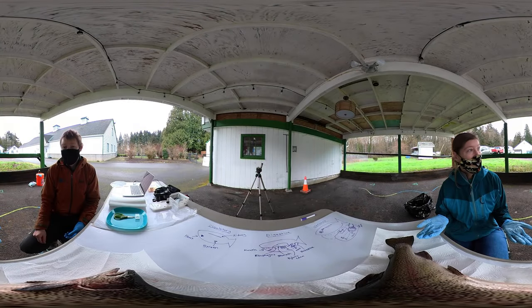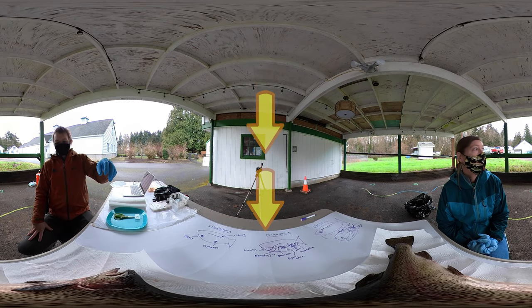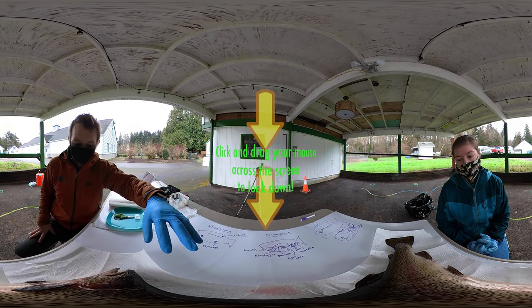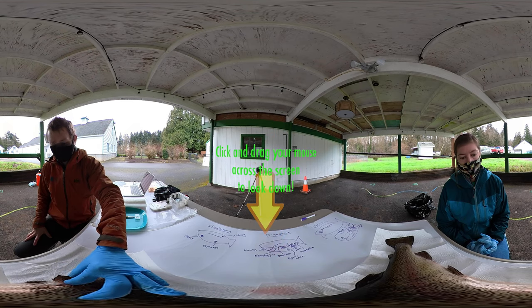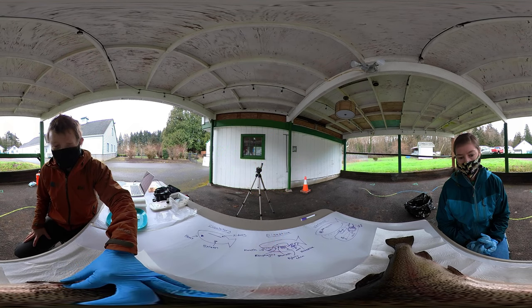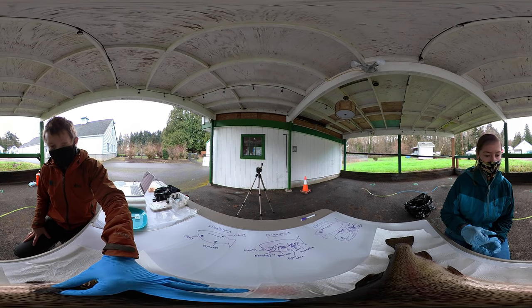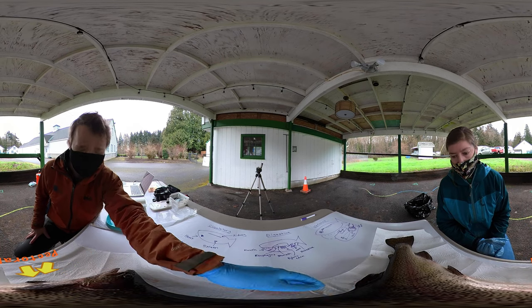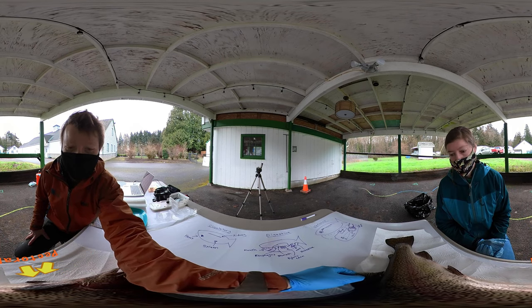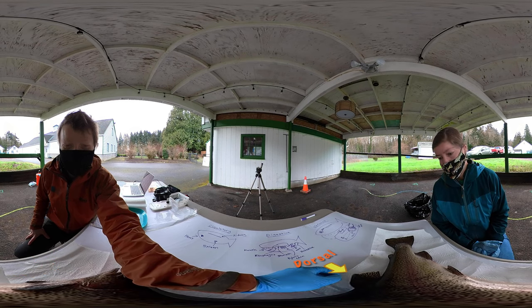Maybe we could start with some external or outside structures. When I look at a fish, the first thing I notice is the fins. I see there's a whole bunch of fins here. I recognize this one in the front — what's this one called again? That one's the pectoral fin. Got two pectoral fins. And then this is like the shark fin — what's this one called? That one's the dorsal fin. Dorsal fin on top.